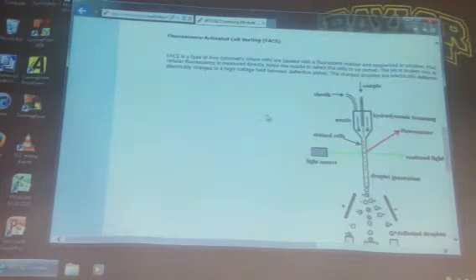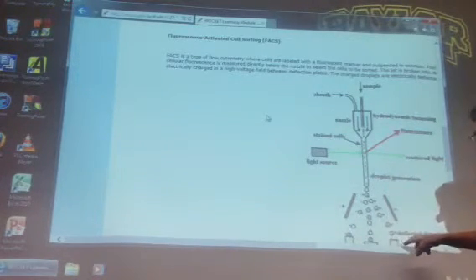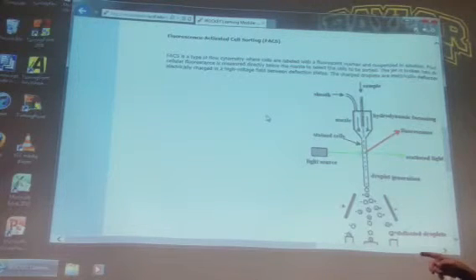So what could we do to identify CD4 positive cells? Bind an antibody. Right, we'll use a fluorescent antibody. So you can get a complex tissue mixture, add the fluorescently labeled antibody against CD4, then run it through here, and then bang, you can collect all your CD4 positive cells from a very complex tissue. It's incredible. When you stop to think about it, it's microdissection. So that's a very nice thing.